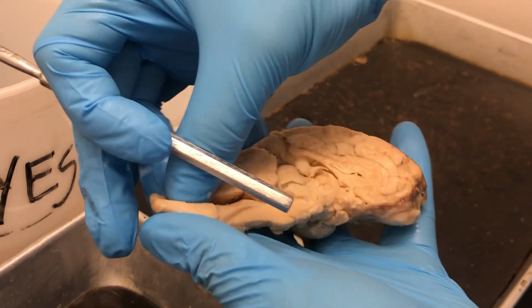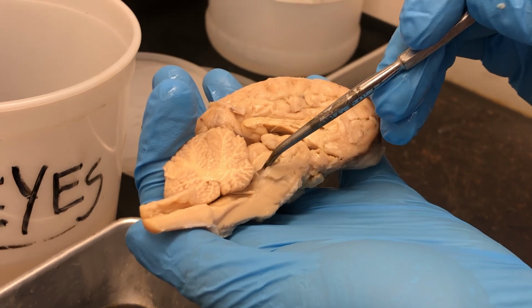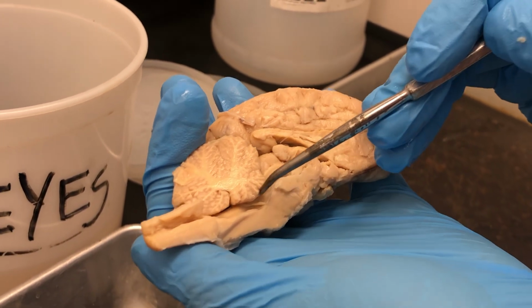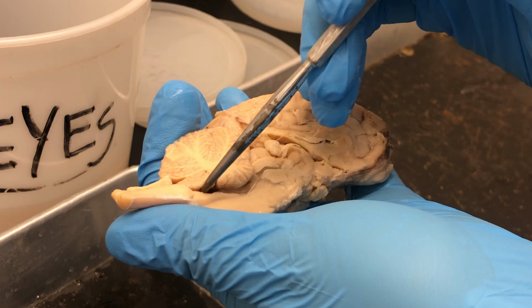So I'm going to try to put this back together. Okay. So this was third ventricle here, then goes through the cerebral aqueduct of Sylvius. And then that will go here. Now we have the fourth ventricle. It's a little beat up, but I'm going to try to put it here. There's open space here. This is the fourth ventricle.